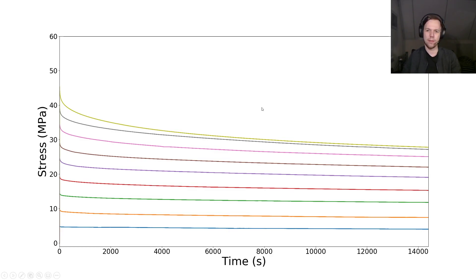Especially if you look at the graph for the 45 MPa initial load, you'll see that even after four hours, the force is still decaying.